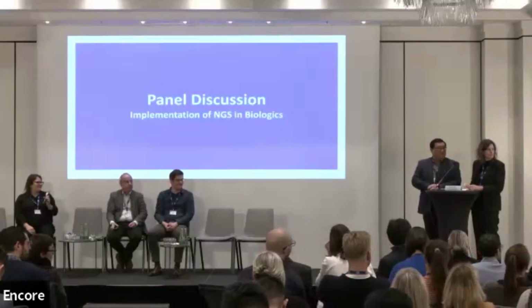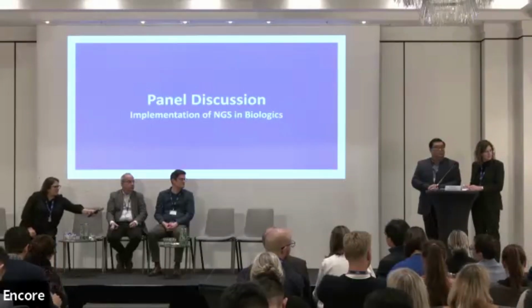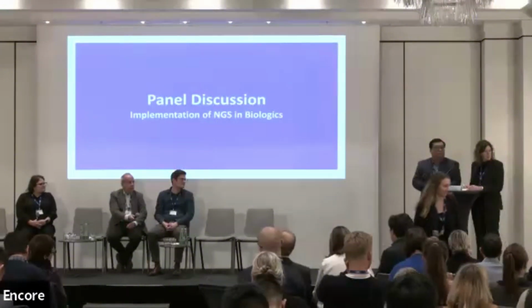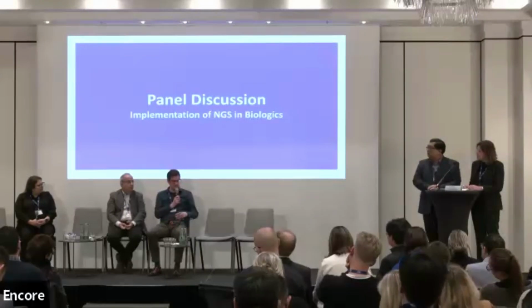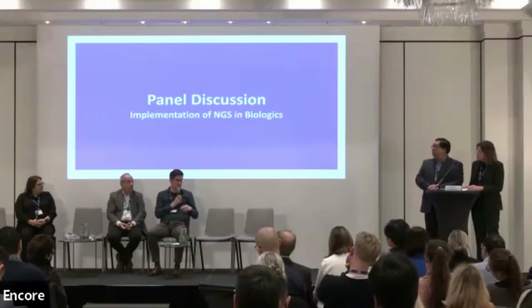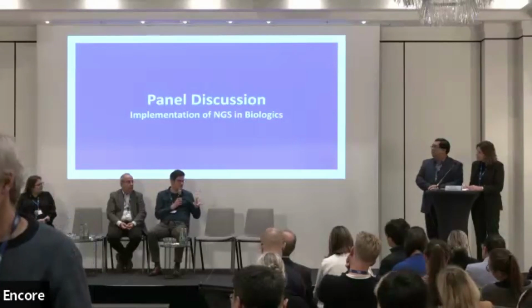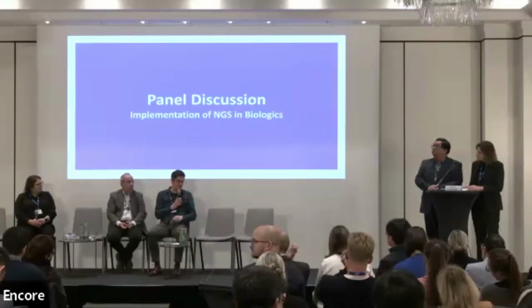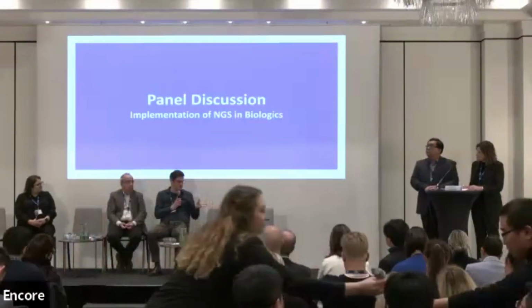Question online. I have a question from Jasmine, and it's for Tom. How do k-mer classification models deal with potential mutations, real or technical, as seen in read sequences? So, a couple of answers. The classification step that we do is using read mapping, so there we have more flexibility to detect that. But of course, there are always some unclassified reads, unfortunately.